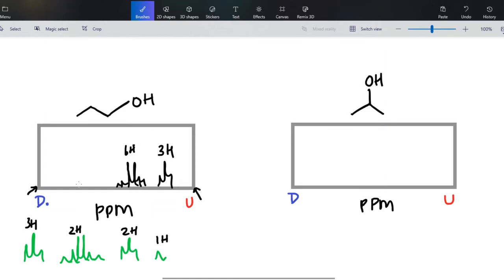And then finally, these 2 H's are heavily downfield because of their proximity to OH. And then the actual H from the hydroxyl group can appear anywhere on your spectrum at any intensity. The important thing is that you'll see it's 1H and has a singlet.